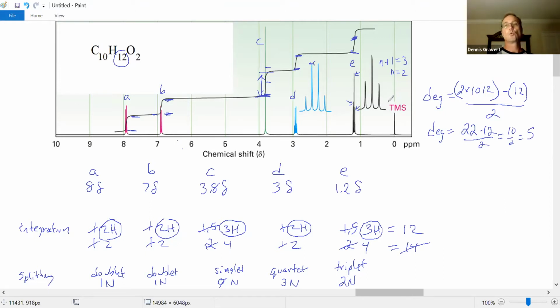Ooh, anytime there's 4 or more, what functional group should you suspect? It's not a guarantee, it's just a suspicion. Benzene. Benzene has a ring and 3 pi bonds for 4 degrees, plus 1 more degree, which could be a ring or another pi bond. Okay, that's not truth. It's not proof or anything, but nature does like benzene.